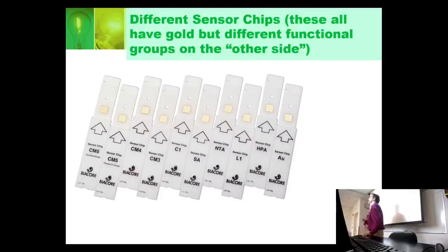It's been oxidized. So when you take a carbon and you oxidize it, what kind of charge do you set up on that? You're taking a carbon and you're turning a CH3 into a COO. What charge develops on the COO? Exactly. So you know that this is going to be negatively charged, and it's also going to have a lot of active COOs. So we want to use that to latch on to the sugar hair.